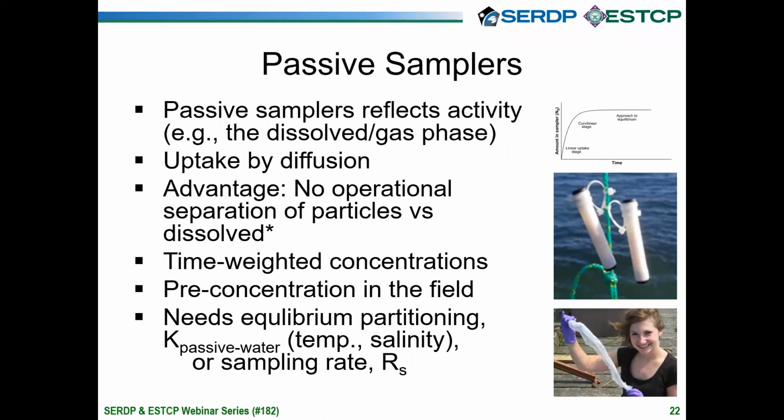But of course, lastly, this is not free of charge. Otherwise, SERDP wouldn't pay for us and many other investigators. We have to fully validate and understand how these samplers work. So that involves either knowing the equilibrium partitioning constants if we're looking at an equilibrium sampler, or we have to understand something about the sampling rate, so what volume of water is extracted by the passive sampler over a given time, and how these are affected by environmental factors.